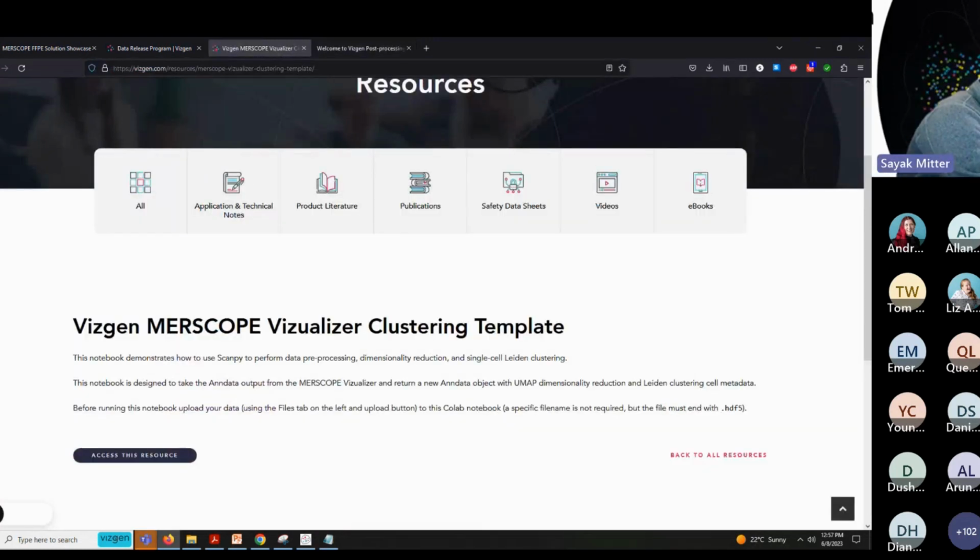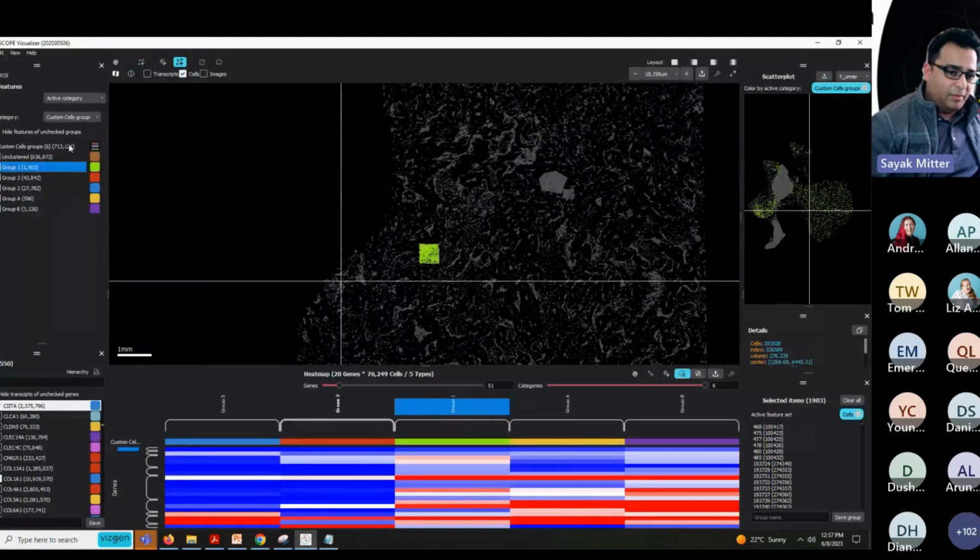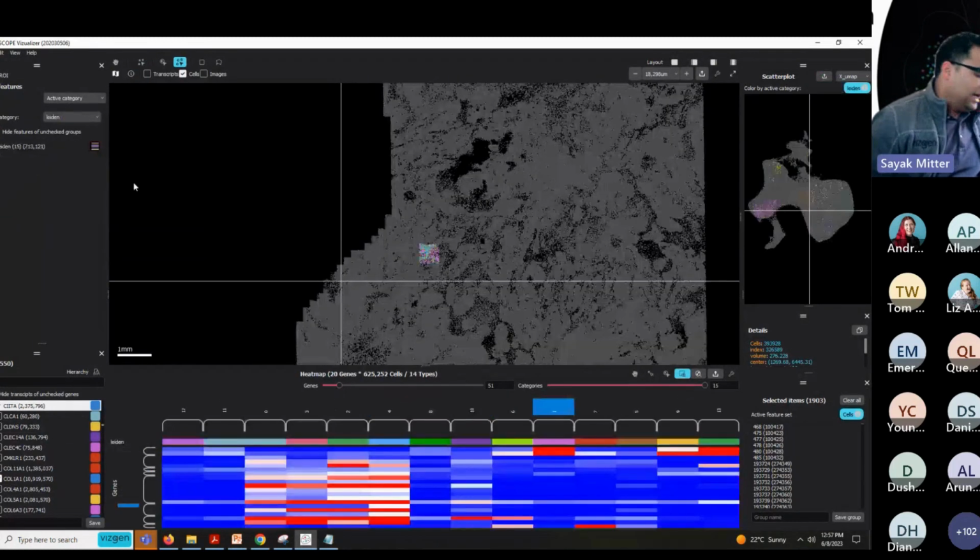Could the file be analyzed? Yes. Great question, Bing. So the file analyzed by VPT can be visualized by the software. We have commands that you can insert in the format there to display and recreate the VZG file so that you can re-import it back into the visualizer.